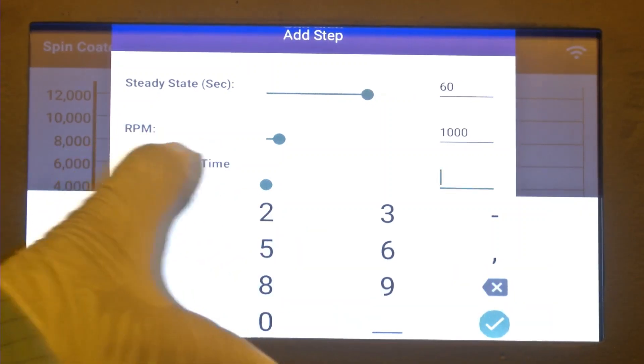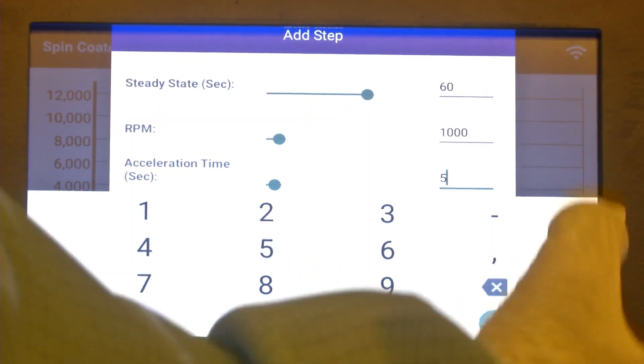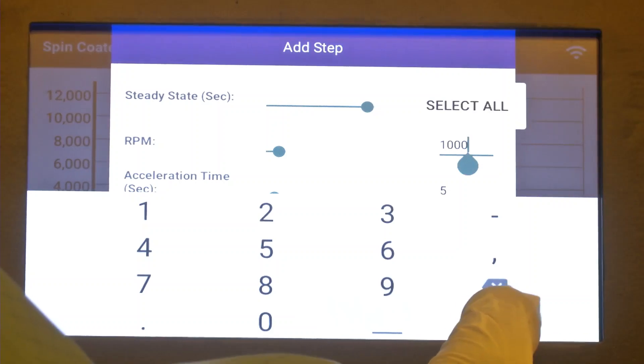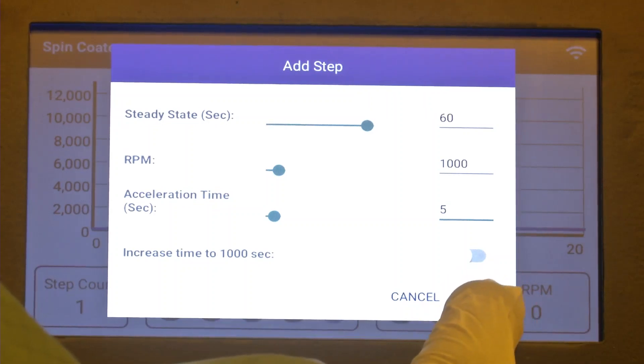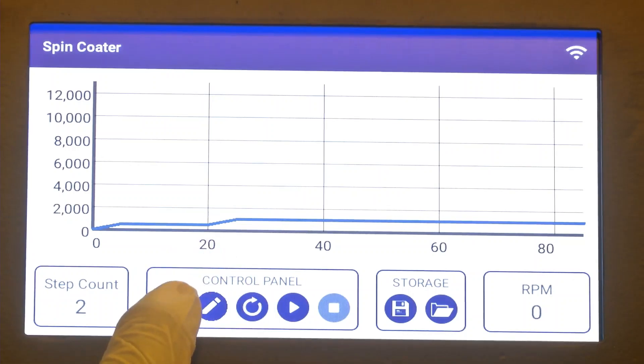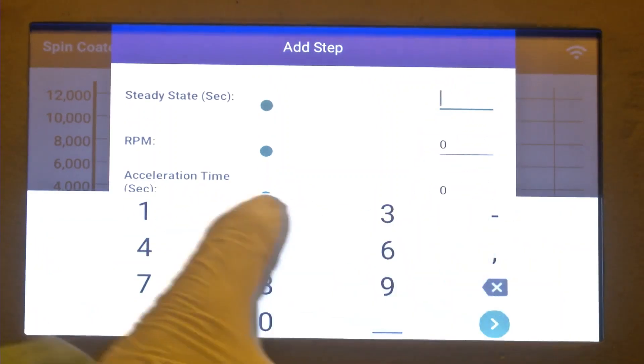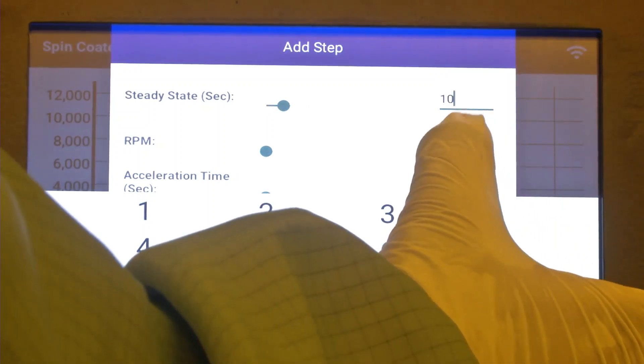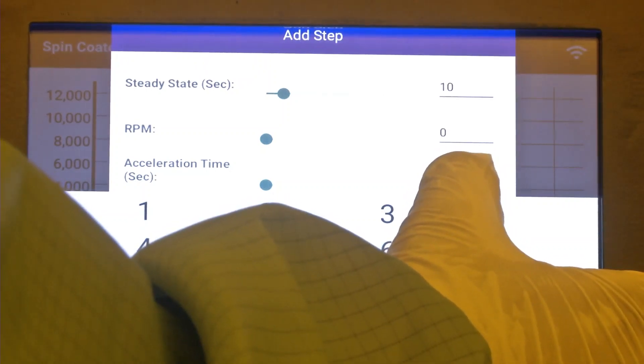We have discussed acceleration and speed. In some spin coaters, acceleration time is given instead. For this we have calculated it to be 5. The spin coaters are almost similar in terms of functioning; only the software interface is different. There is one more final step called the ramp down step to ensure that the spin coater does not stop abruptly. We can give it for 10 to 15 seconds at 500 RPM so that it goes down to 0 at a very gradual speed.